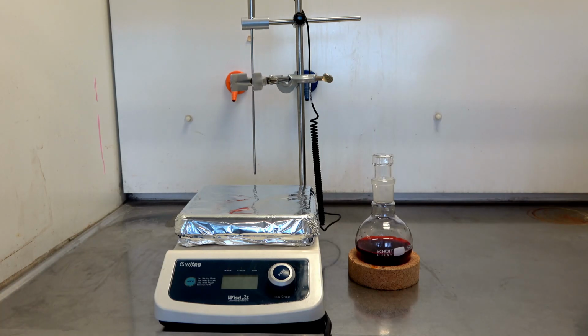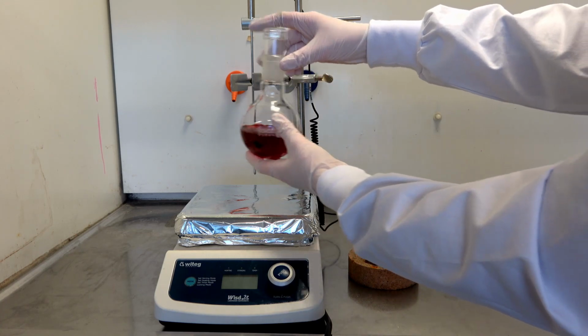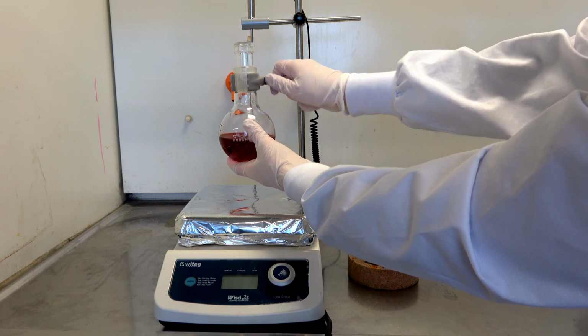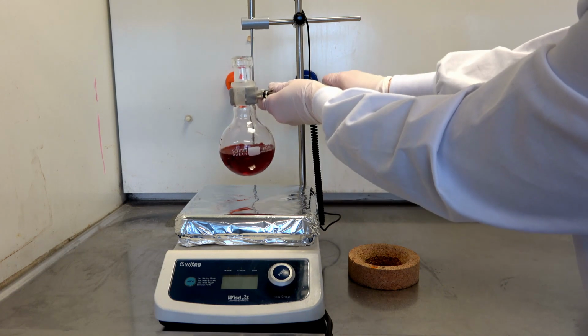When choosing glassware, make sure it has no cracks. When a round bottom flask is used, it needs to be securely clamped to a stand before the magnetic stirrer is turned on. Fix the clamp to the neck of the flask and adjust the position of the flask so that it is in the middle of the plate.